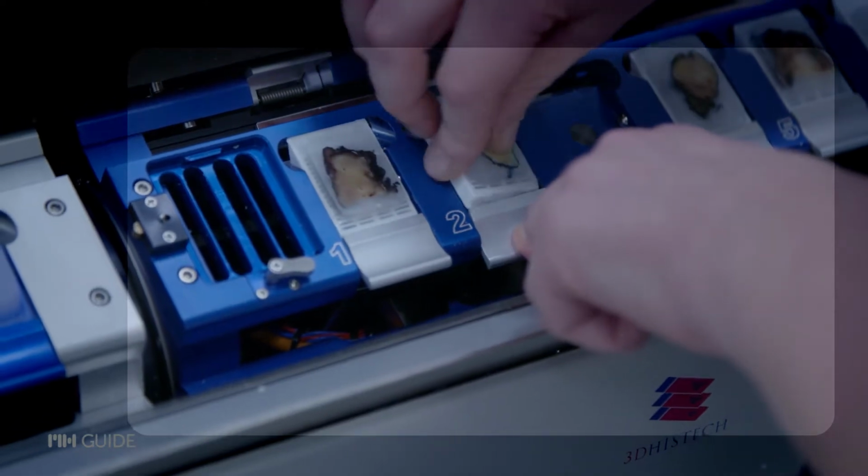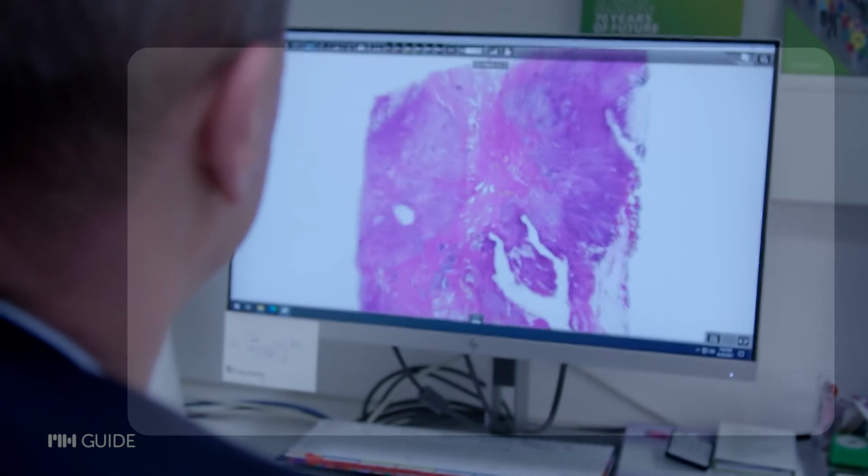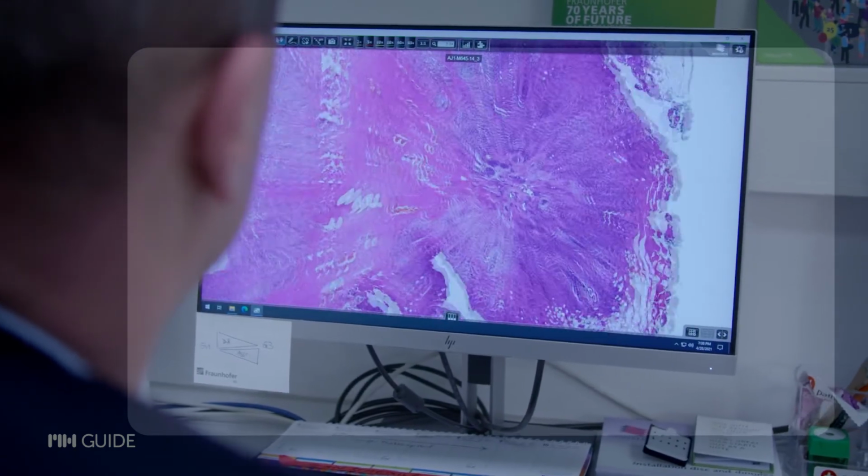In the past, you would sequence single genes and report the results individually. Nowadays, you sequence all coding exons or the whole genome. And the question is then, how do I efficiently get this onto paper for these many patients? And also, explain it to the clinician and discuss it with the tumor board.